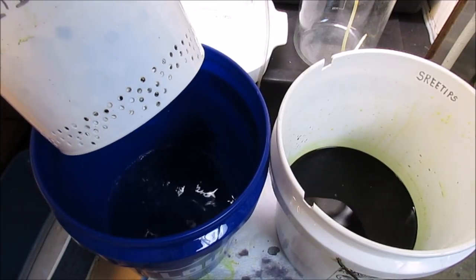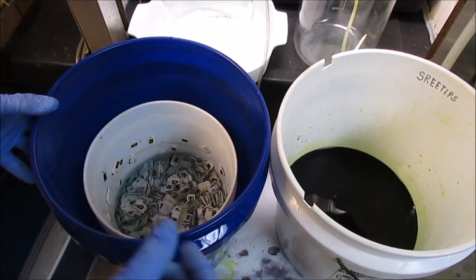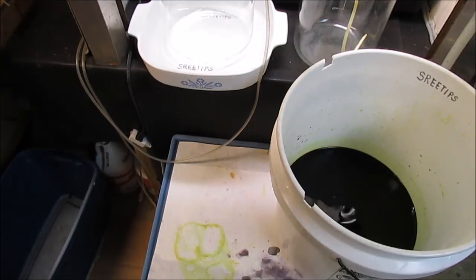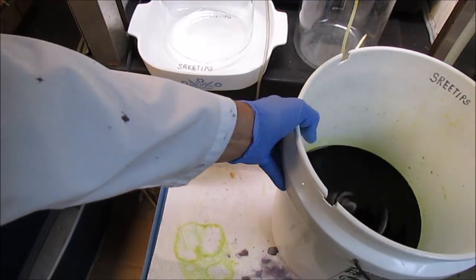Whole bunch of gold foils down in that rinse. So what I'm going to do is set this aside for right now. And I'm going to go ahead and pour this off into some beakers here.